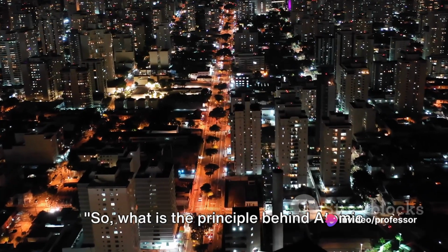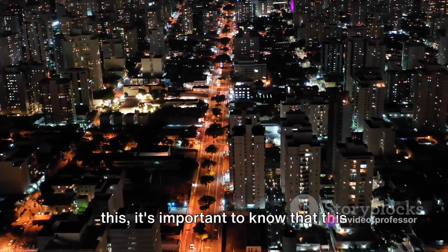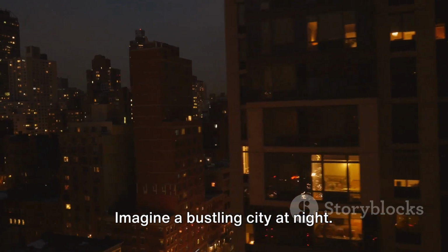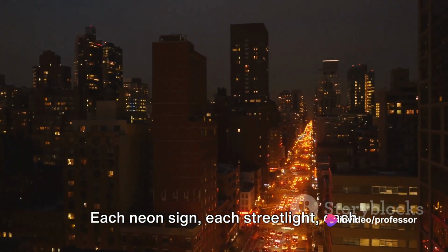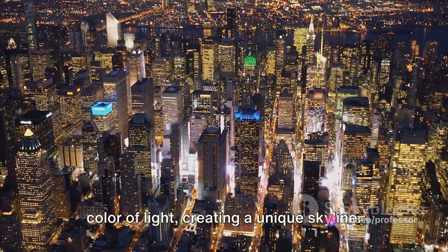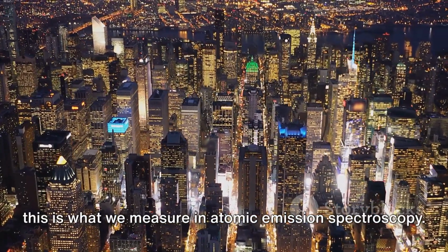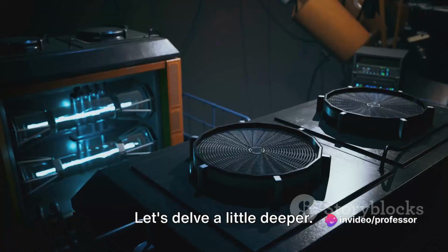So, what is the principle behind atomic emission spectroscopy? To understand this, it's important to know that this technique is all about measuring the electromagnetic radiation emitted by atoms. Imagine a bustling city at night. Each neon sign, each streetlight, each lit window, they all emit a different color of light, creating a unique skyline. Similarly, every atom emits a specific wavelength of light when it's excited, and this is what we measure in atomic emission spectroscopy. Let's delve a little deeper.